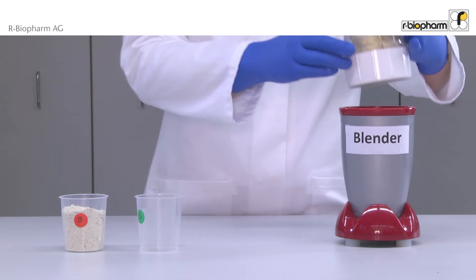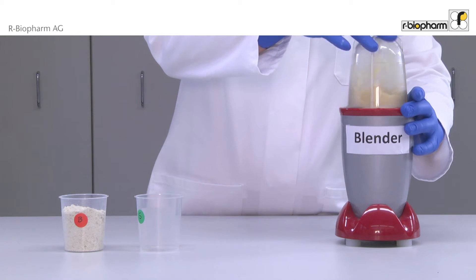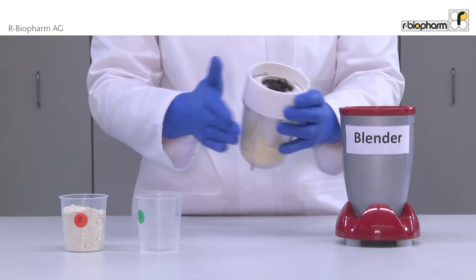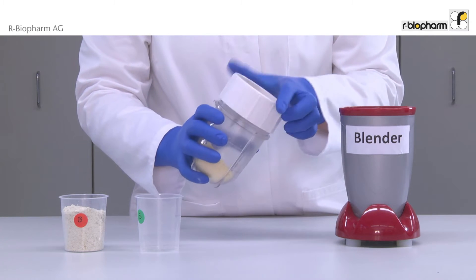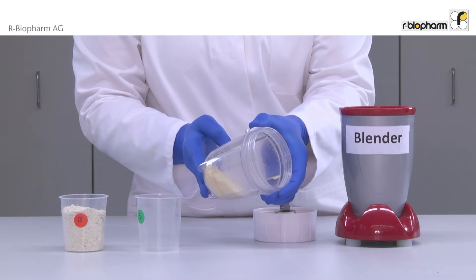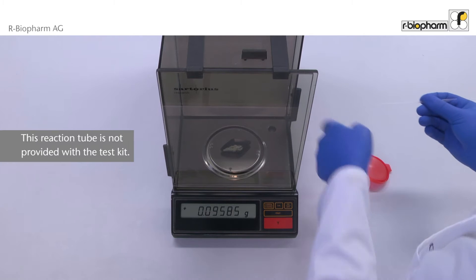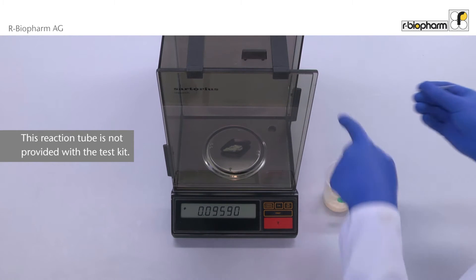Grind the sample with a blender. Then 100 mg of homogenized sample is weighed in and transferred into a reaction tube.